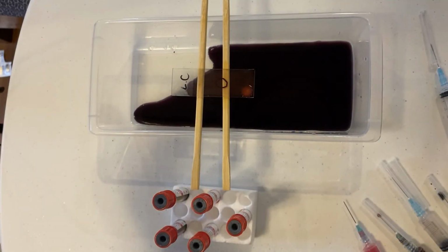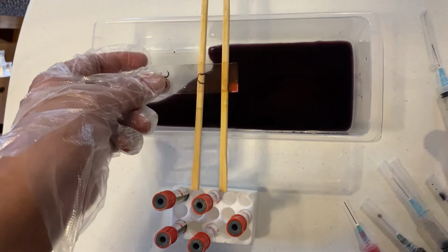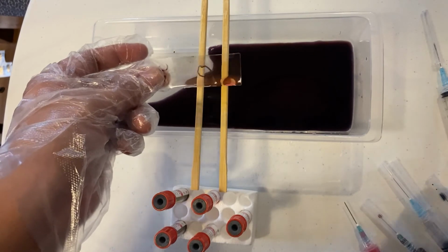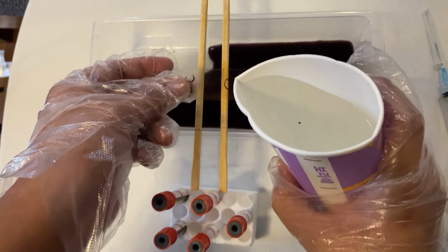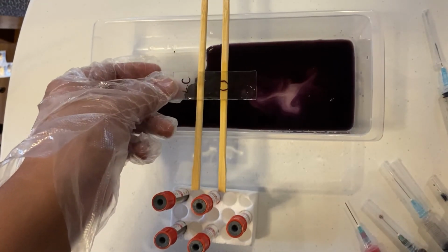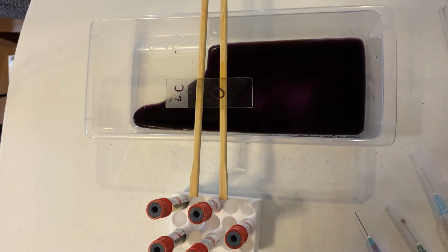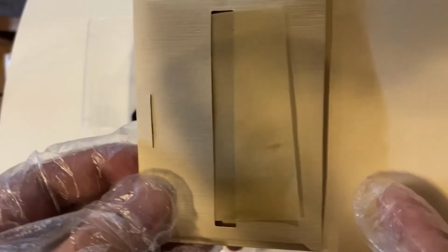After staining the slide for 30 seconds, we will now rinse it with distilled water. Then, we will dry the slide using a blotting paper.